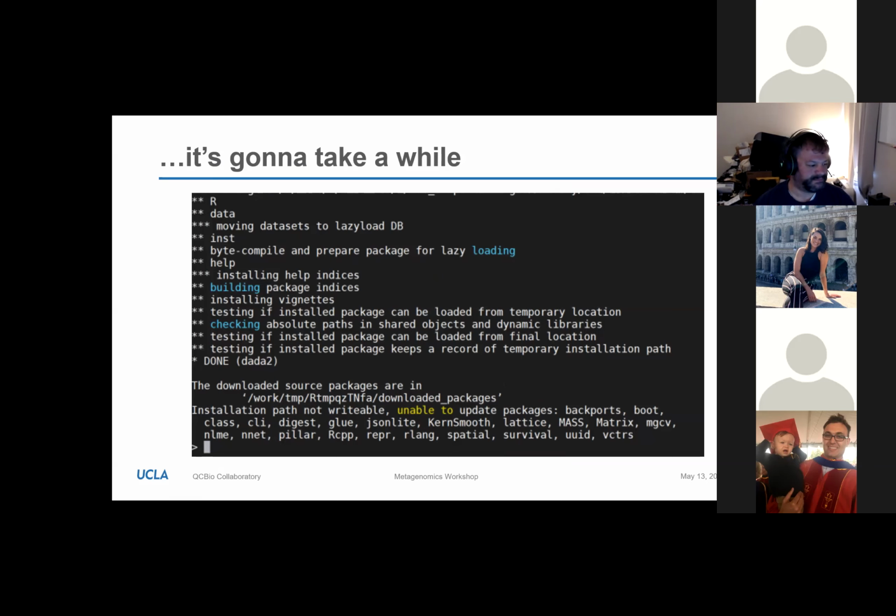I got that message too, but then I have warning messages below that. I don't know if those are bad news bears or not. I think this generates a lot of errors because Hoffman doesn't always tell it where it can't write to until after it tries to write there.